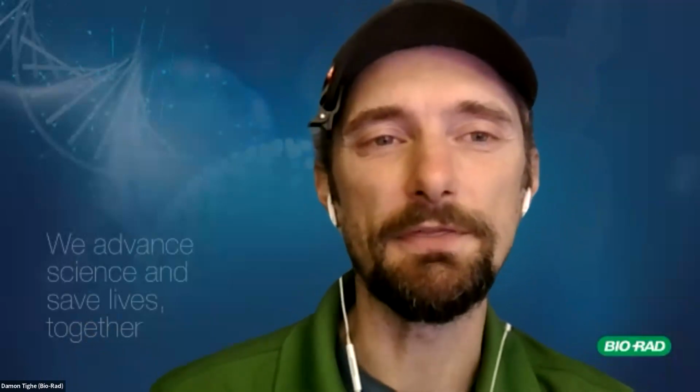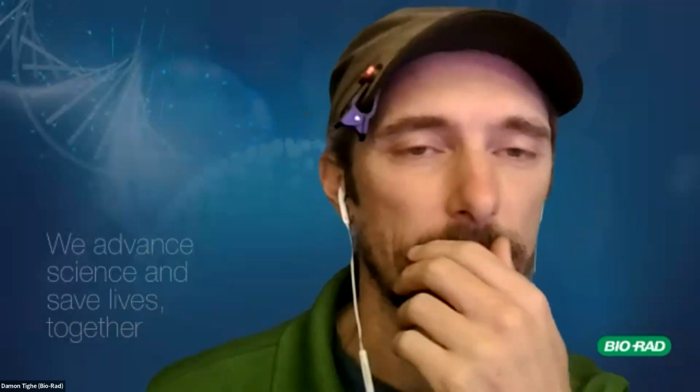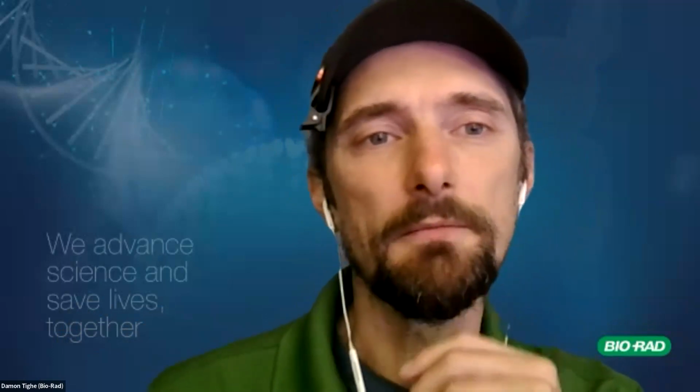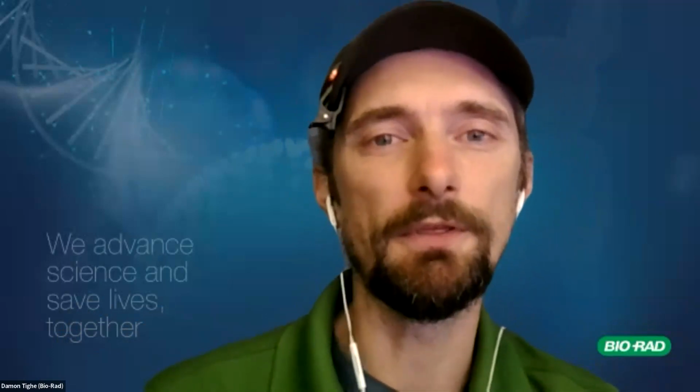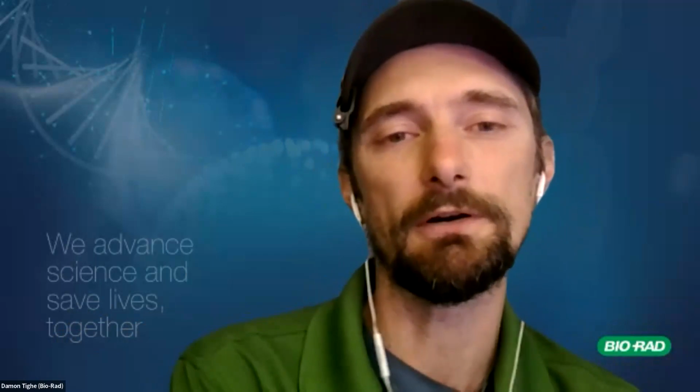And the nice thing is with that, it's often one of those that you can appeal to students' built-in competitiveness as well, because then you can say, who can give the best standard curve at the end of this, within this set of pipettes. The troubleshooting, though, I think is really, really key, but that's something that you can start really early on in your programs too, when you first introduce PCR.